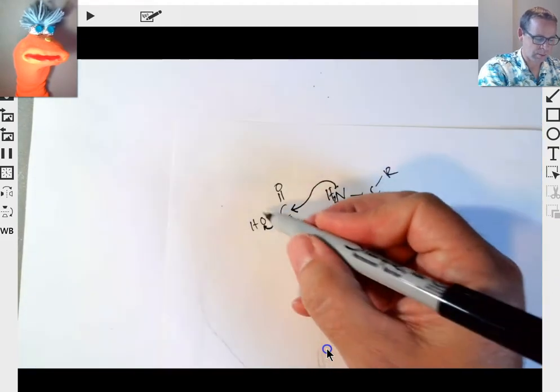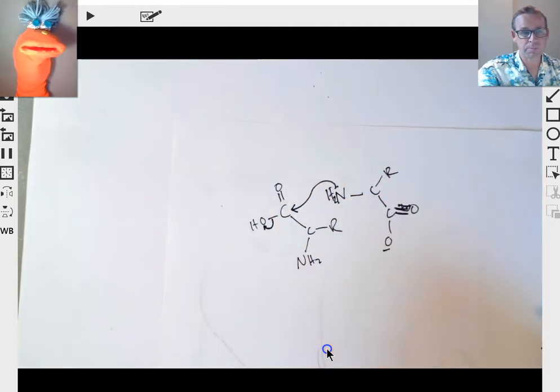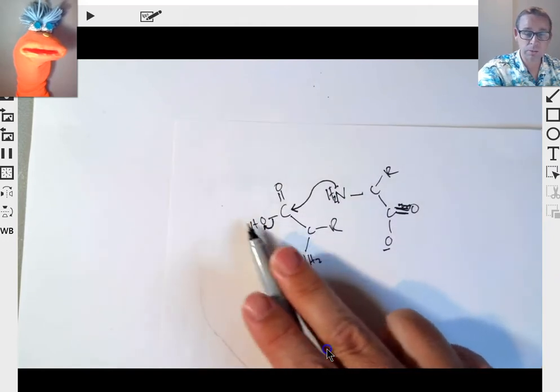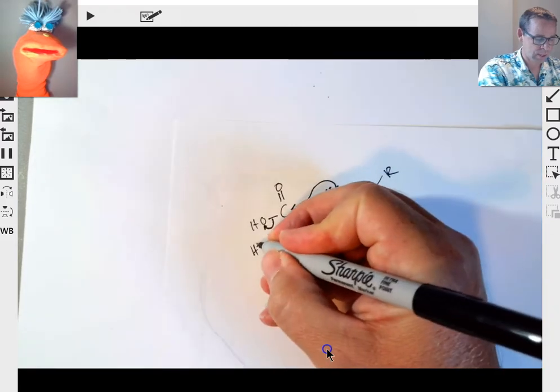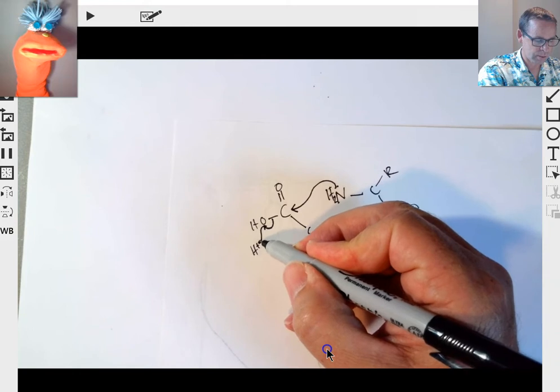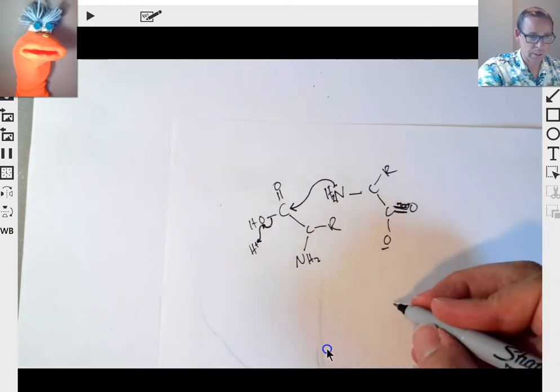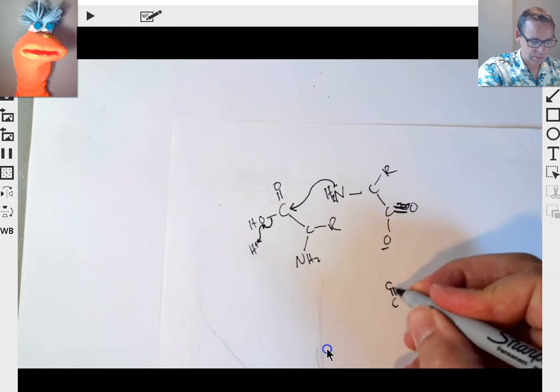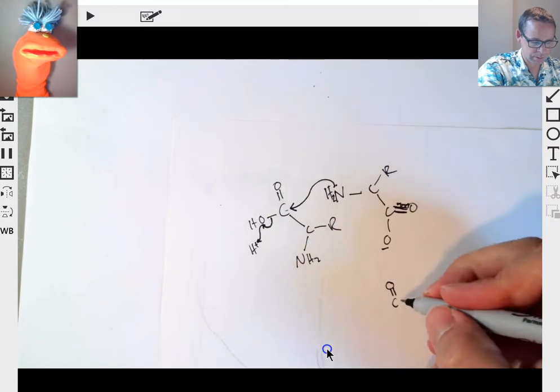This is generally going to be received by a water molecule or a proton in solution. So if you have slightly acidic conditions, then the electron density will pull over to here.